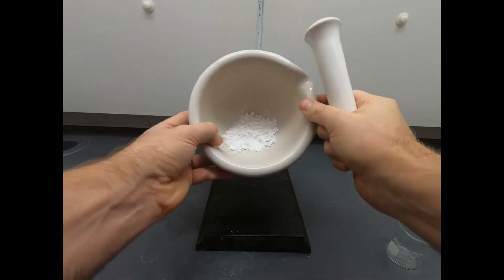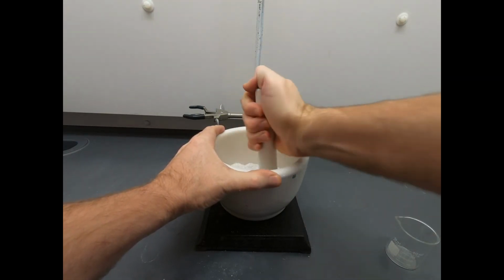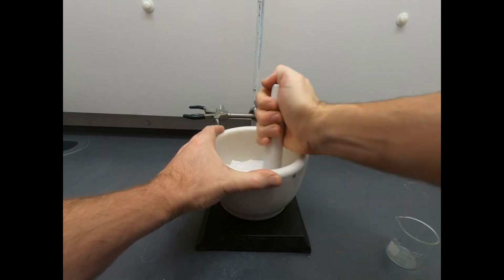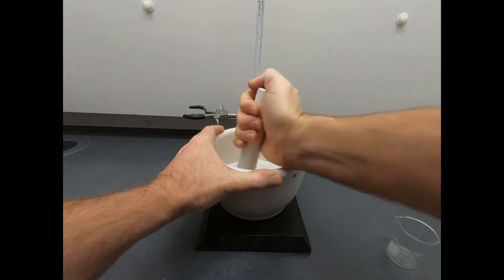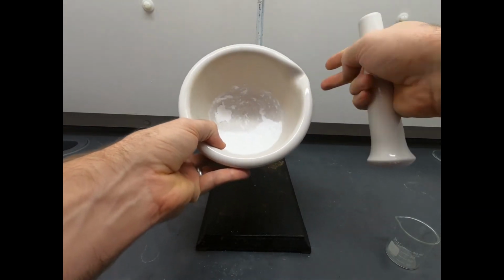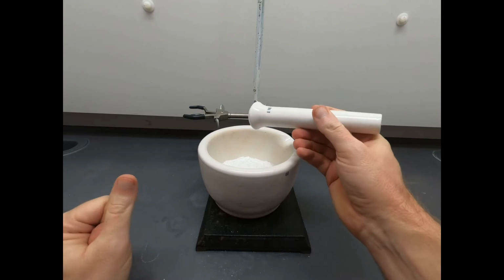Okay, that's pretty good. So that's kind of powdery now, but we can do a whole lot better than that. So now, I hope this isn't too loud on the microphone. This grinding noise is not the most pleasant. I never want to grind this stuff long enough. I always want to declare it done too early. You can go a little bit extra and try to get this as a pretty fine powder. And that's pretty decent.